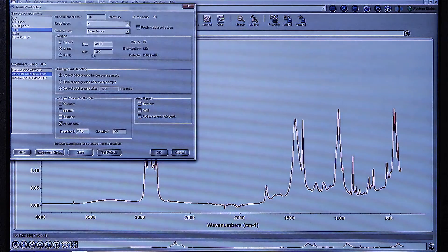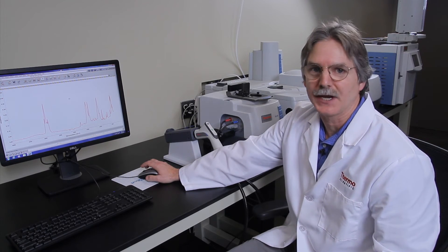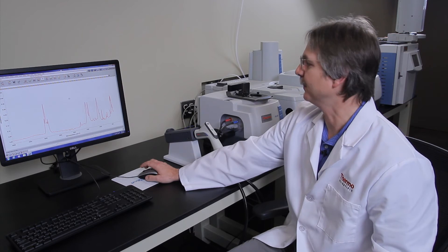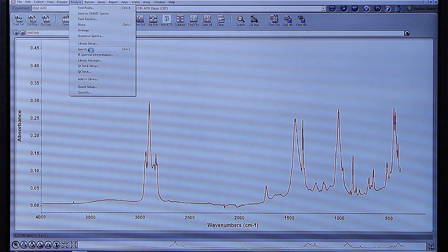So I'll change some of the parameters to collect the far-infrared portion of the spectrum. Once I set up those parameters, the beam splitter changer in the instrument will change the beam splitter to allow collection of far-infrared spectra. Meanwhile, while that's happening, I can look at the spectra and do an analysis to help determine what the sample is.